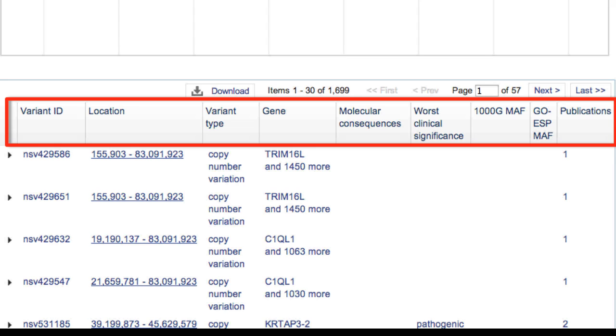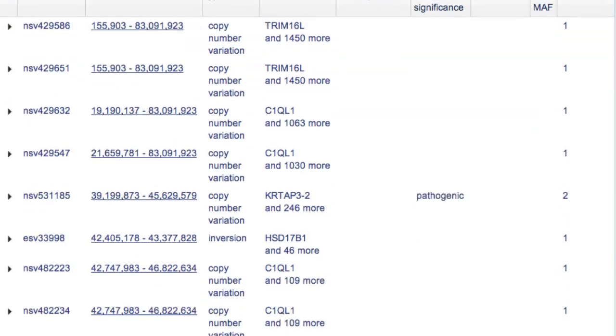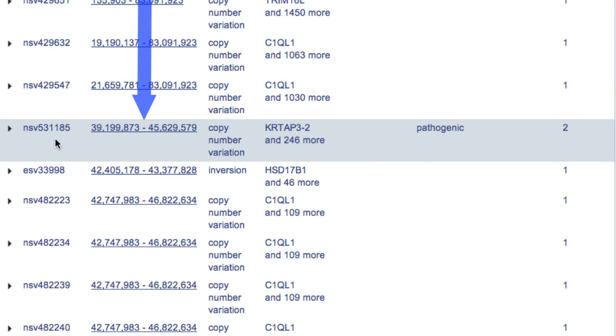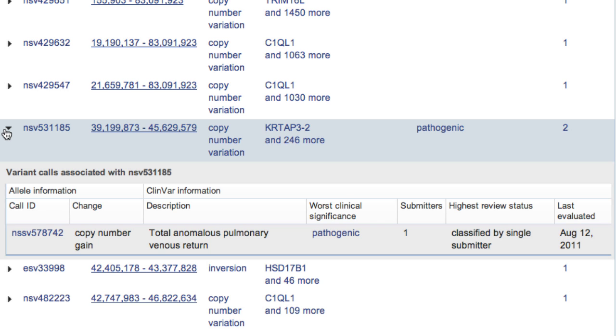The variant table provides these data, and the rows are sorted by location and can be expanded by clicking on the triangle to reveal allele information from ClinVar.